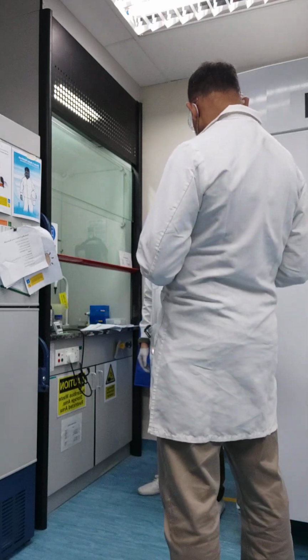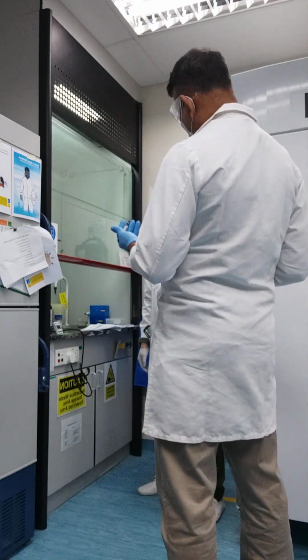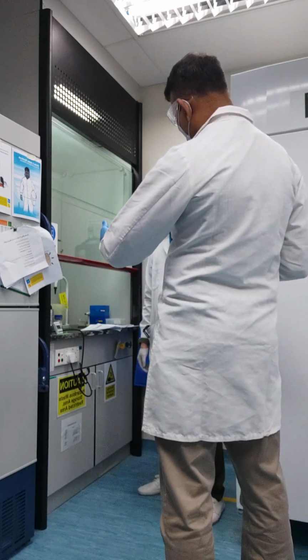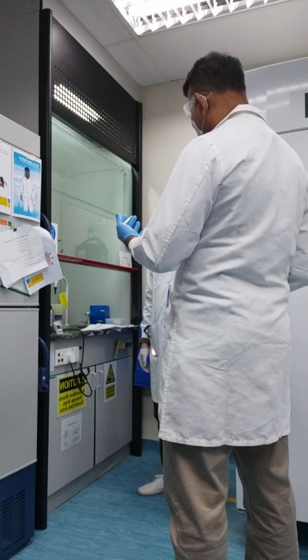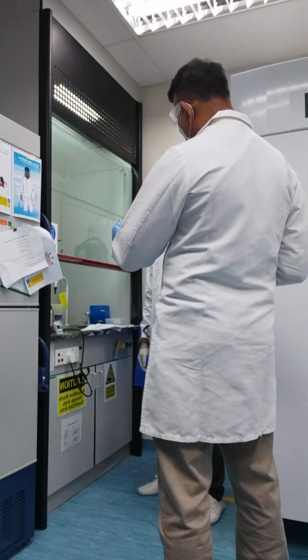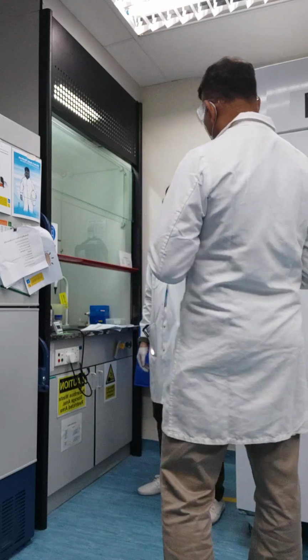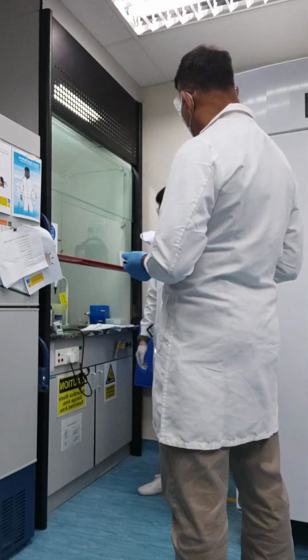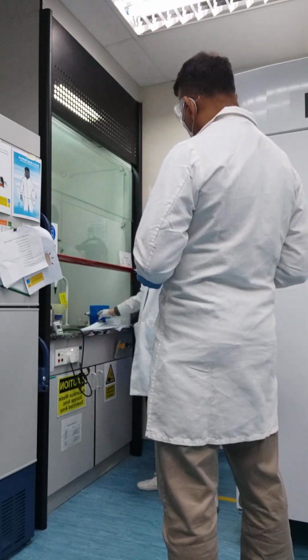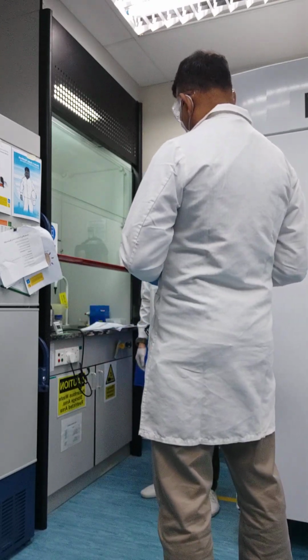Excellent. My second question is, how do you identify that you have the correct information, especially the safety information of the chemical that you are handling? I have to refer to the safety data sheet. Confirm.